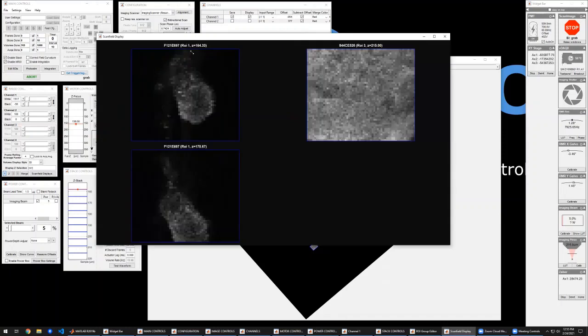So that's just a few ways that you can utilize the multiple region of interest feature. Like Bruce mentioned, Aaron Curlin used this kind of imaging technique to image entire dendritic tree structures and getting upwards of 10, 15 Hertz volume rates, which is pretty great for doing volume imaging where normally you're limited to something much slower. So I'll go ahead and turn it back over to Bruce at this point and let you continue.